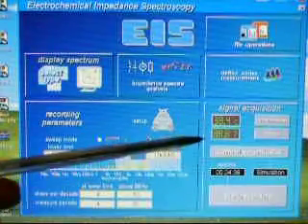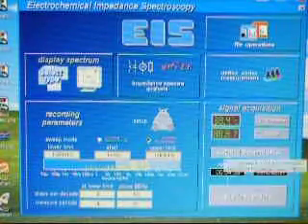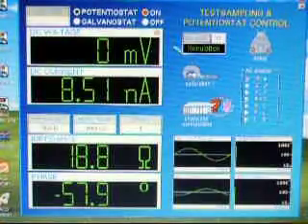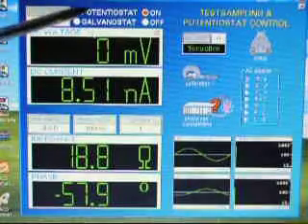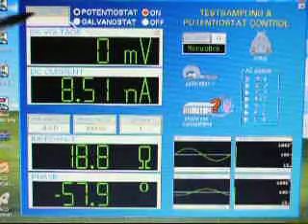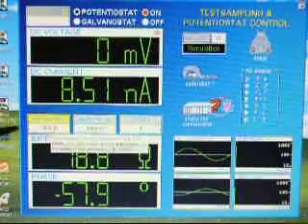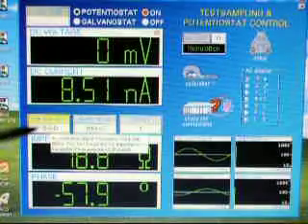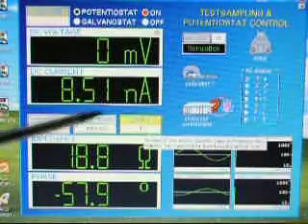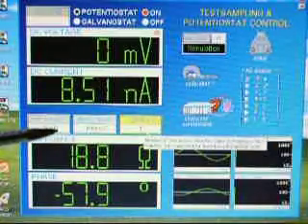We can also go to control potentiostat, which will access the potentiostat setup where we can be in P-stat or G-stat mode. We can set a DC voltage, set an AC frequency to start, AC amplitude, and how many integrations before we'll actually take a measurement.